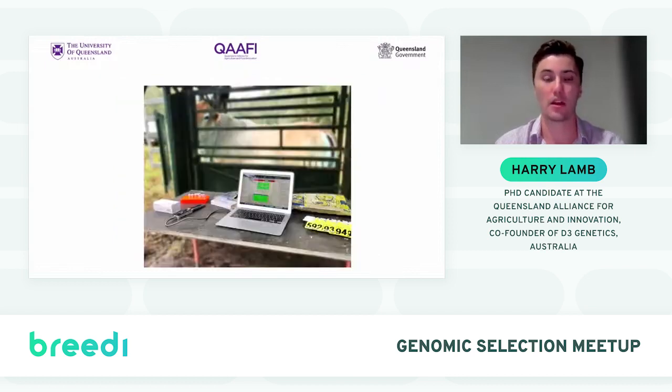After seeing that we could take it to places like Antarctica, the International Space Station, and even into the Amazon, we thought in our lab, well, why can't we actually take this device onto farms and provide breeding values or genomic breeding values for farmers on the farms rather than them having to send samples off to the lab?